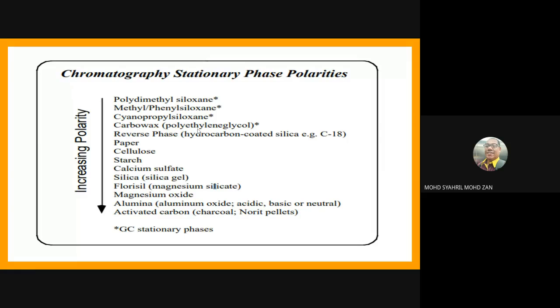Bahan yang memang tak boleh volatile dia akan duduk. Yang volatile akan duduk kat sini, ataupun dia berada di bawah sekali.